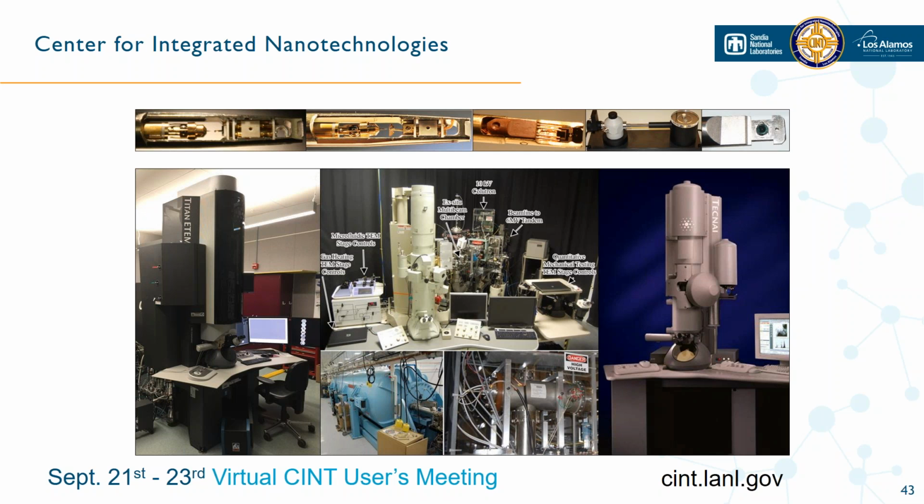We have several microscopes, and also John's in charge of a cryo suite for cryo-FIB, TEM lamella lift-out, and then of course we can use that with cryo holders or vacuum transfer holders to image structures in the TEMs.